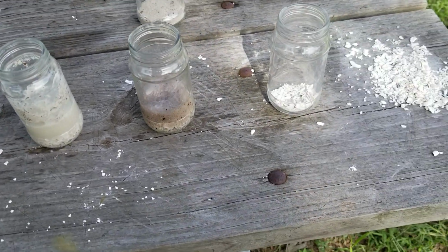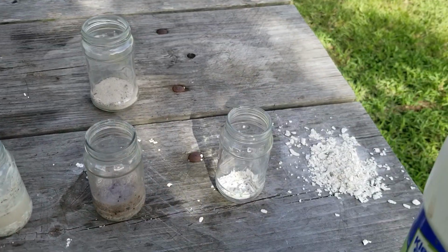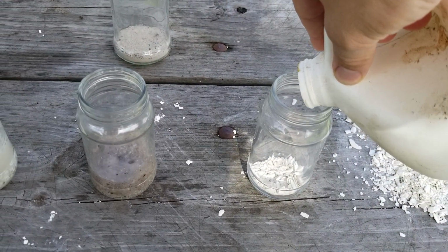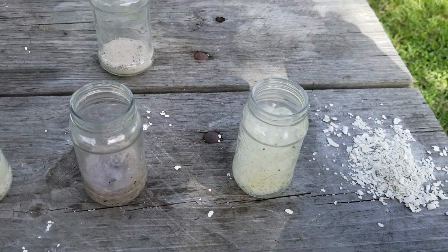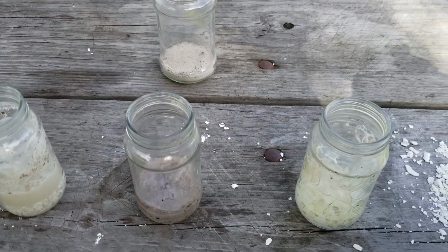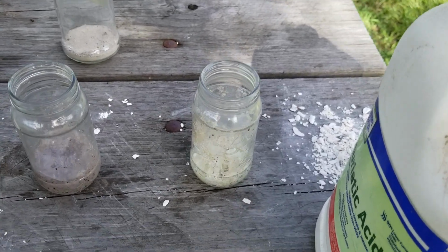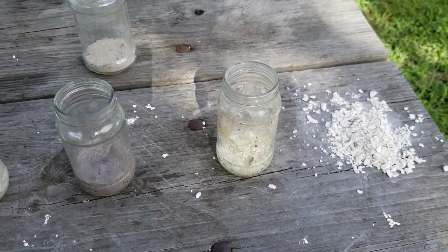And then my favorite is hydrochloric acid. Now, I'm also about out of hydrochloric acid, also called muriatic acid by other brand names. When you mix this in, calcium chloride is produced, and calcium chloride is very soluble. So this bubbles rather quickly. And see, those bubbles are coming out much faster than the other two, the weak acid versus the pretty much insoluble salt. Here we have a soluble salt being produced, strong acid being used. Everything is in its favor to produce calcium chloride. It just wants to react.